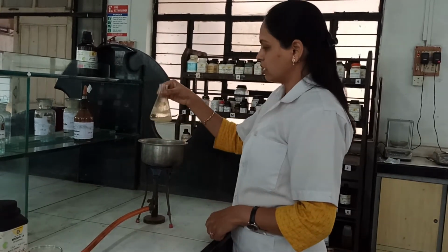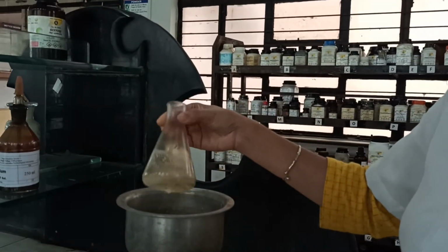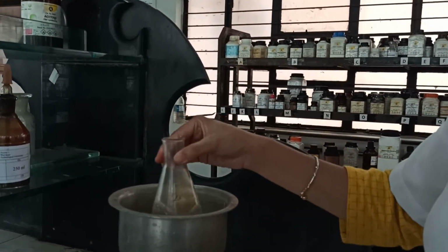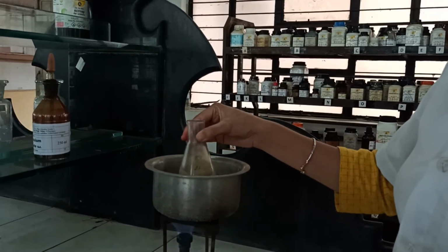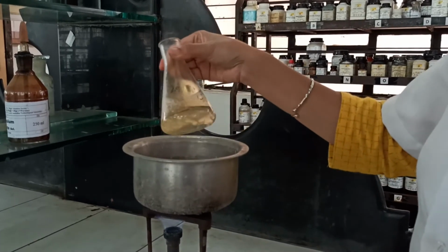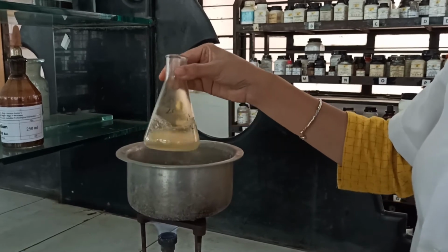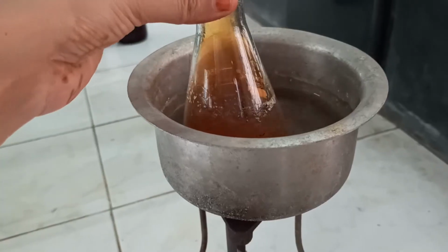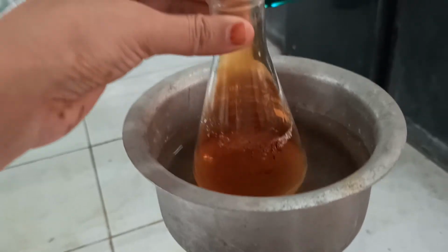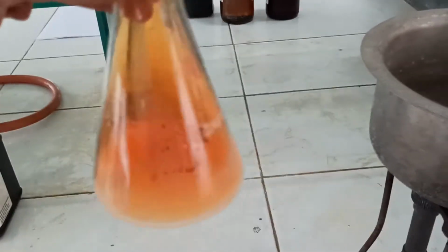You will see that benzoin gets dissolved in the nitric acid. Students, you can see the change in color and the consistency of the reaction mixture. After heating, about 10 minutes has passed.